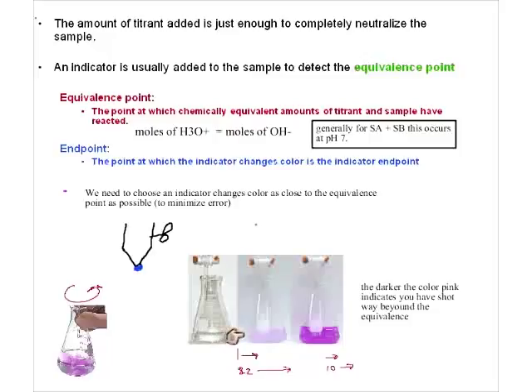If we continue to put sodium hydroxide in here, the color is going to get real dark. And the darker it gets, remember, means that the equilibrium is going way beyond, and it's favoring the products, and it's going to be really, really dark, and the pH is going to be up around 10, which is way too far. So for phenolphthalein, we still want to be careful that we stop it real early so that we get this light pink and not the dark pink.